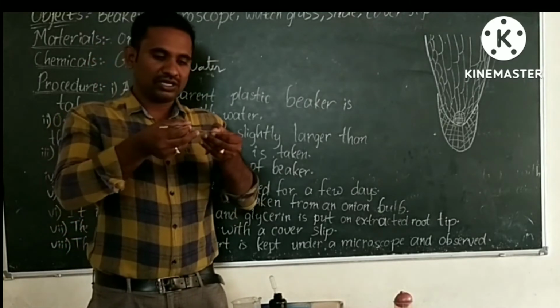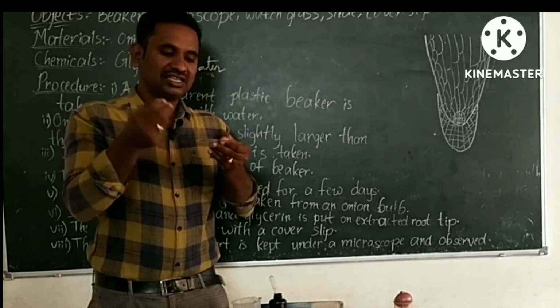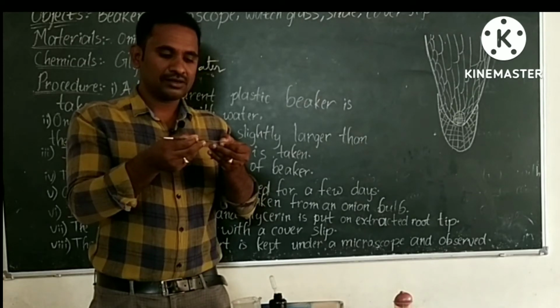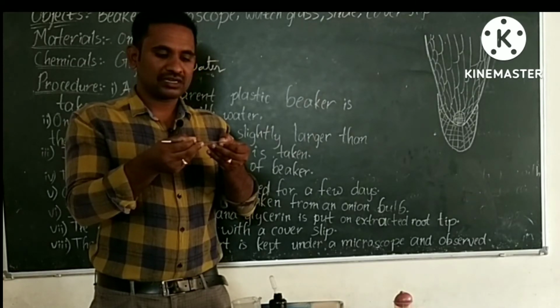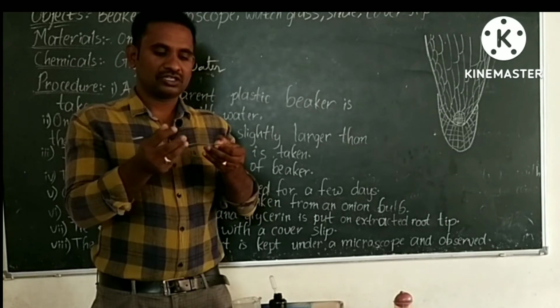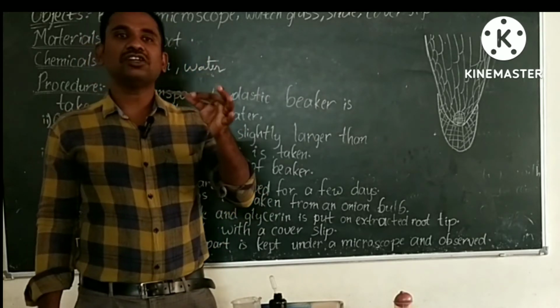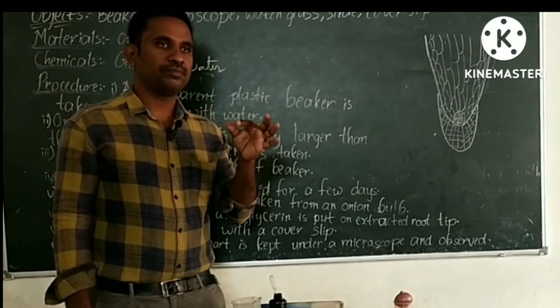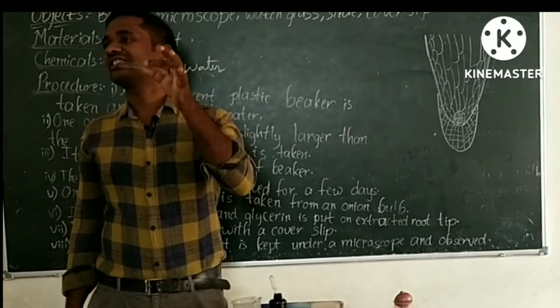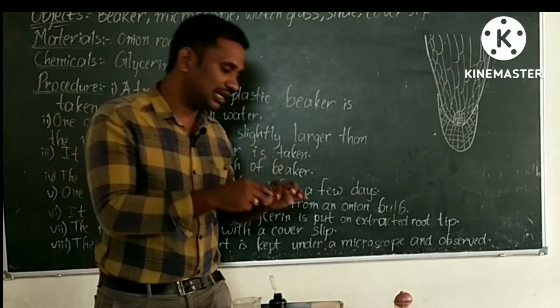So we can use the other, blunt end of the brush and gently press the cover slip. Okay, so now this is the slide we prepared, and we can observe it under the microscope. Do you understand? This is how we make the slide.